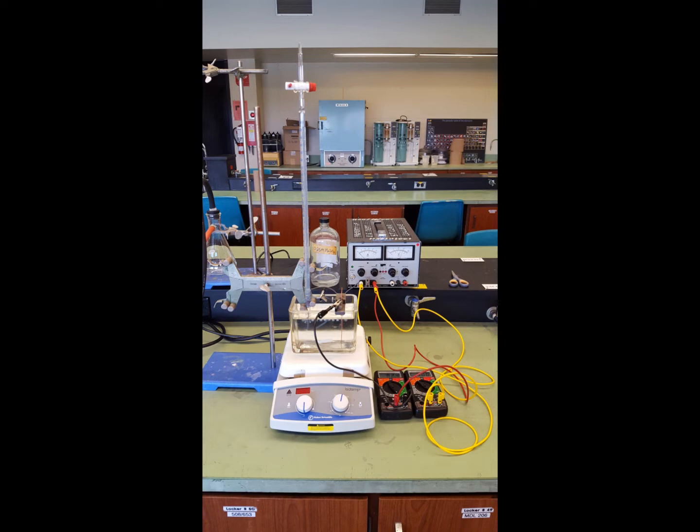In the tank on the right side you'll see a strip of copper metal. Now that copper is first cleaned by dipping it for maybe a minute in 6 molar nitric acid to clean any oxides off it. Then rinse thoroughly under the tap. Dried by dipping it in acetone, and it'll dry very quickly. Then weigh it to 4 decimal places on the analytical balance so we get an exact mass.